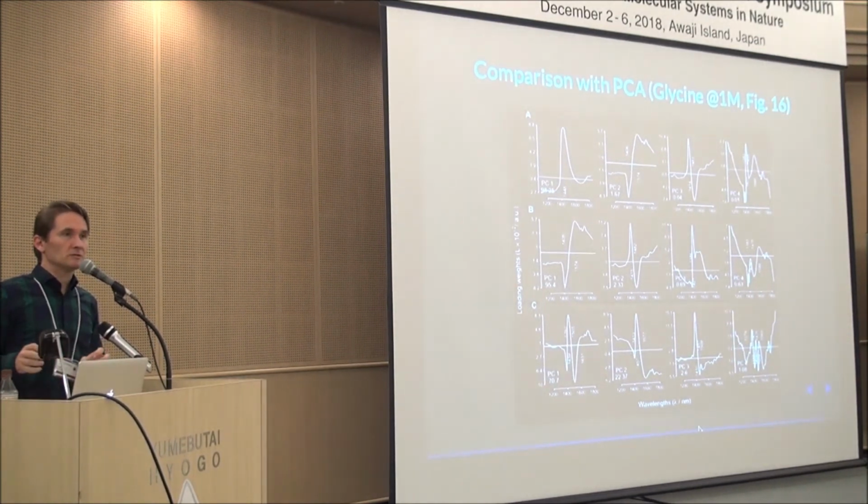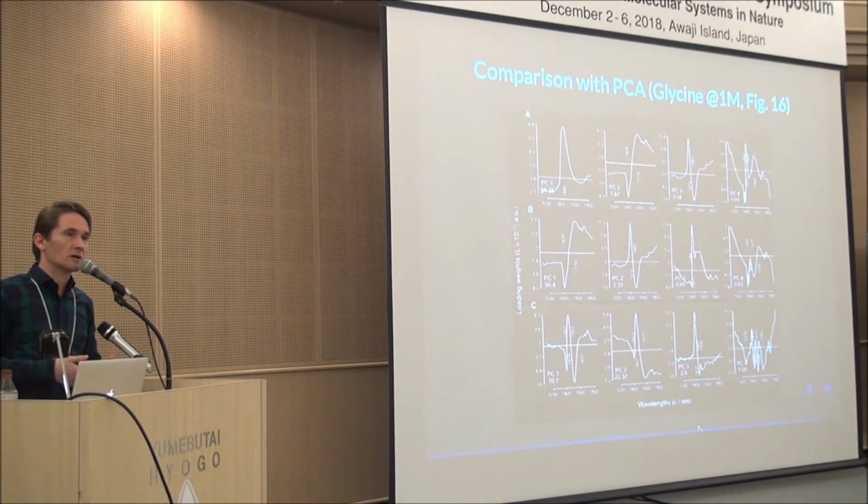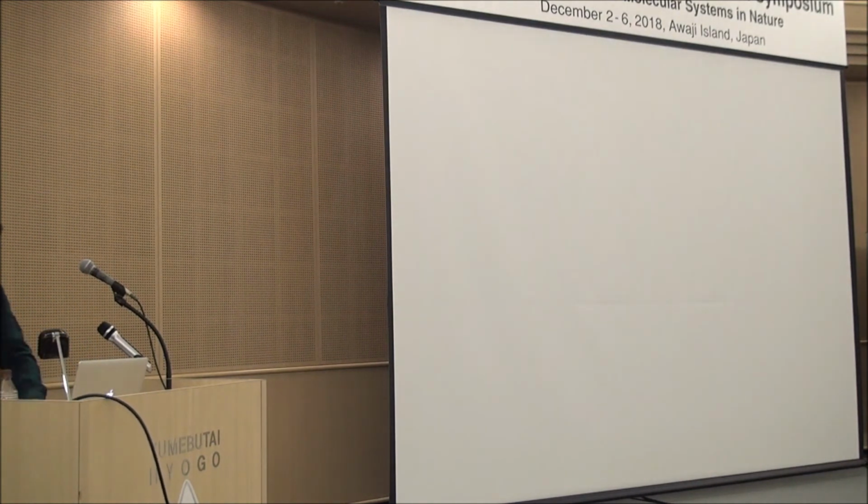So keeping those three spectra is the way to go in future, because, as I mentioned, there is a mixed effect, temperature shift and solute-related shifts that are entangled. At the moment I don't know how to untangle them, and as long as that is the case, I will keep using the spectrum that was subtracted. So thank you.